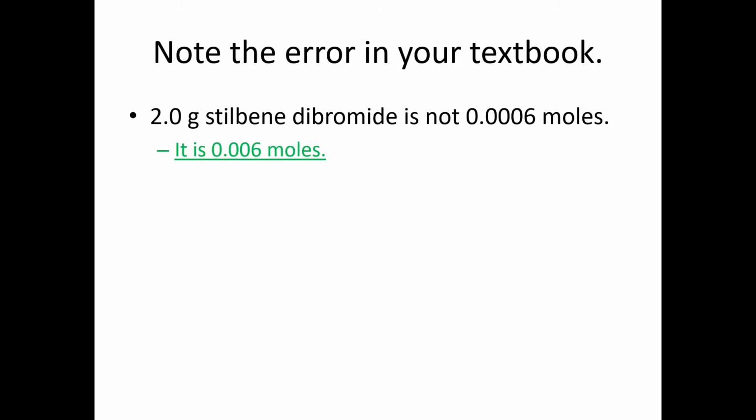Just something to note, in our lab manuals, I believe it says that 2 grams of stilbene dibromide is about 0.0006 moles, when it's actually about 0.006 moles.